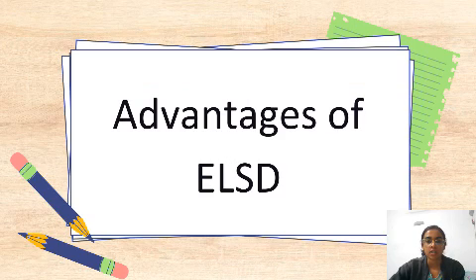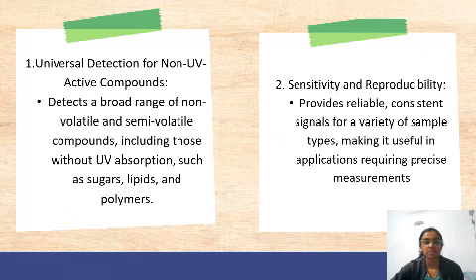Let's see the advantages of ELSD. First is the universal detection for non-UV active compounds. It detects a broad range of non-volatile and semi-volatile compounds, including those without UV absorption such as sugar, lipids, and polymers.